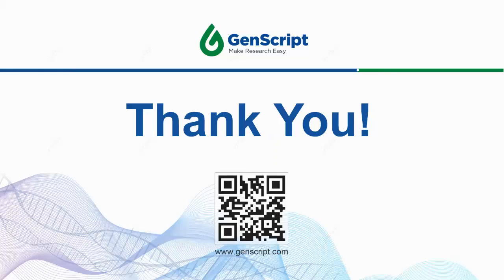So the first question for Dr. Yu, it looks like your T-cell activation reagent is better than TransAct from Miltenyi. Do you know why?